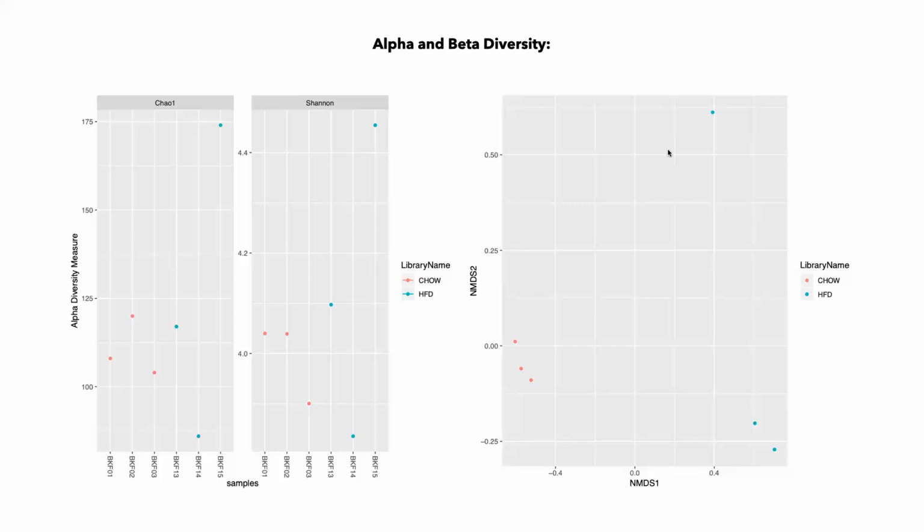Okay, so this is the beta diversity chart. Beta diversity is like looking at a way to measure differences in diversity overall, right, in your whole data set. So let's imagine we have different colors of Skittles, okay? And so you have one sampling, right? You have two big buckets of Skittles. You take multiple samples from each one, okay?